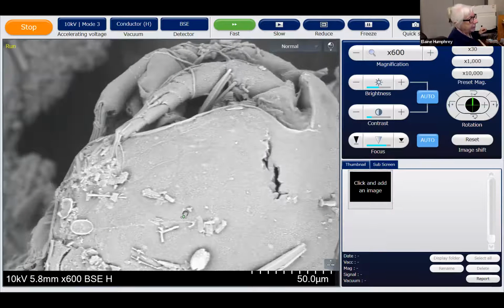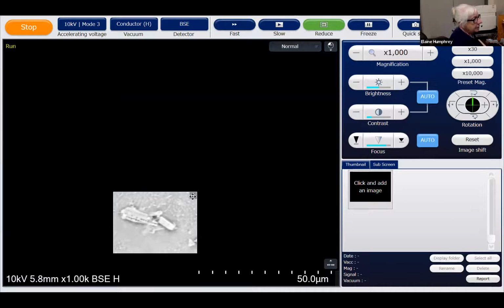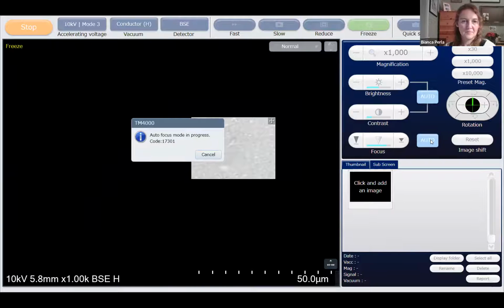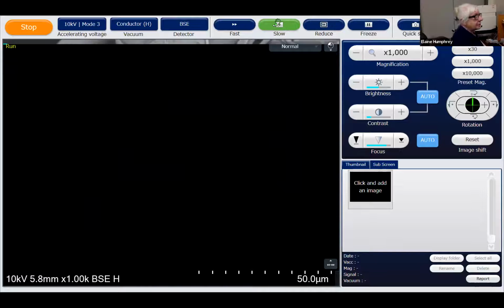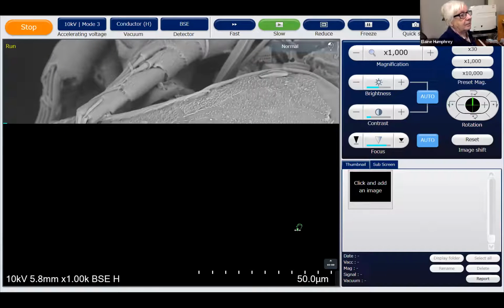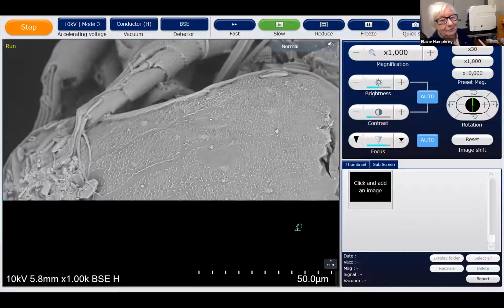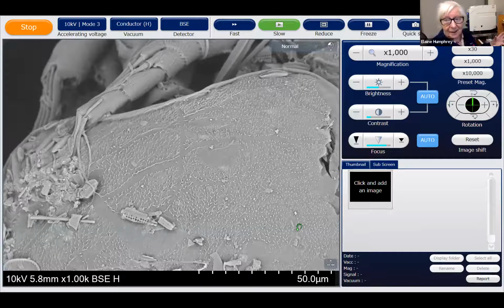Now this guy got broken, but if we zoom in here, the reduced window allows me to focus on a particular part. You'll see he's got little sensory hairs all over his body, and I'm 98% sure, at least, I have a hypothesis that we haven't managed to actually figure out, but I think these sensory hairs are in a pattern. So I think that they sense the way the water is moving over the body.